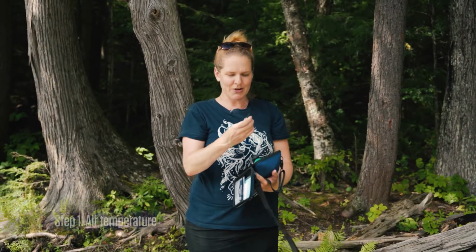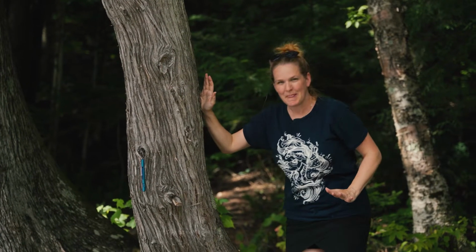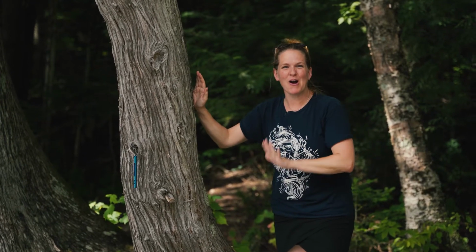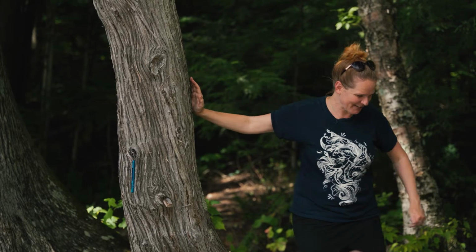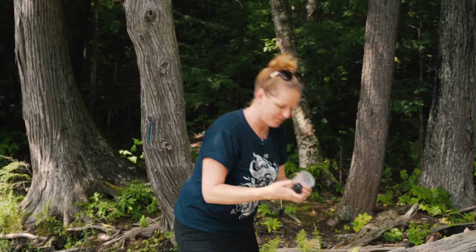First thing I'm going to do is take my thermometer out and hang it in a tree. I'm going to leave that there while I do my test. If you do the same thing, always remember to come pick it up before you leave. I've forgotten mine a few times and had to return back.